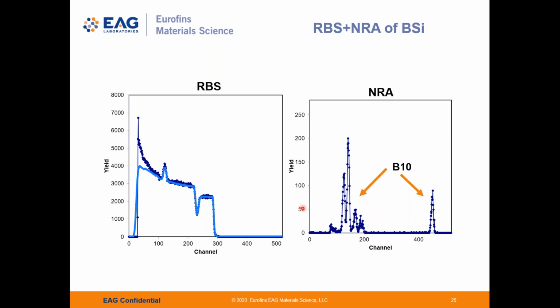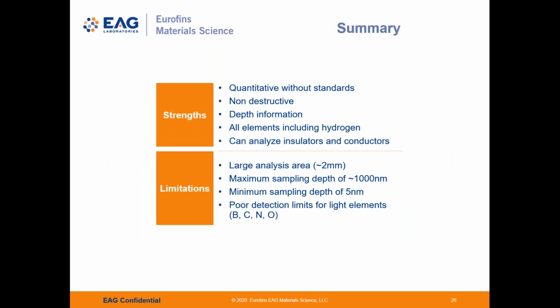We now come to a summary of the strengths and limitations of RBS. The strengths are that it is quantitative without standards, with reproducibility to somewhere between 3 to 8%. The method is non-destructive. RBS can provide depth profile information.